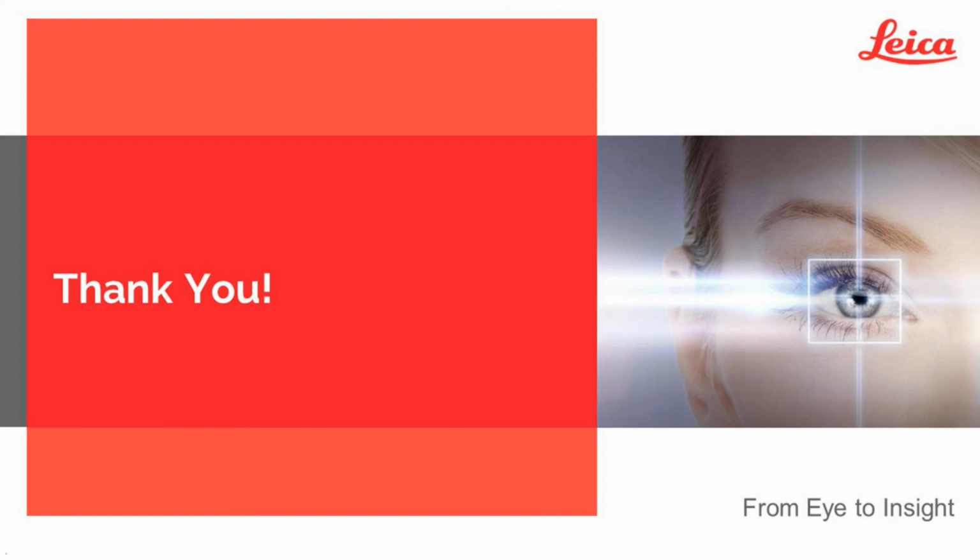Great, thank you. Our next question asks, what kind of system do I need to train a deep learning model? Yeah, so for deep learning models, typically what you will need is a modern GPU that is capable of running deep learning. Most commonly used ones are made by NVIDIA, but there is other hardware that is capable of doing machine learning as well. But in the context of the software that I presented, Aivia, we use an NVIDIA GPU that is CUDA capable.